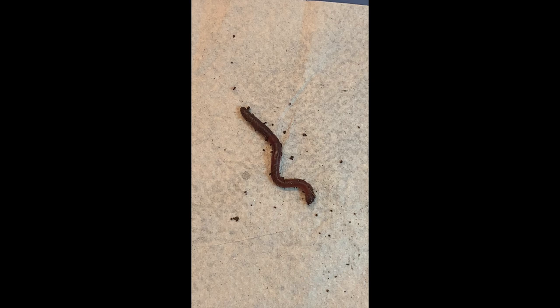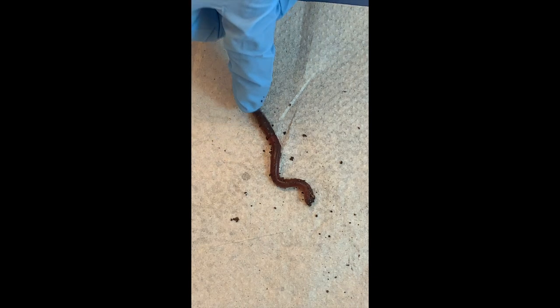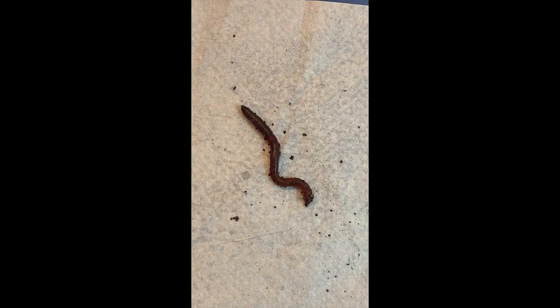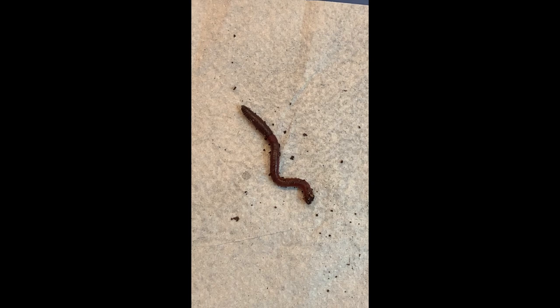Earthworms actually use their skin to breathe — they don't have lungs or gills. And they have five pairs of hearts — ten hearts total. For more love! They have these repetitions of organs, and later in evolution we start seeing animals fuse those repeated parts, leading to distinct head, thorax, and abdomen regions.